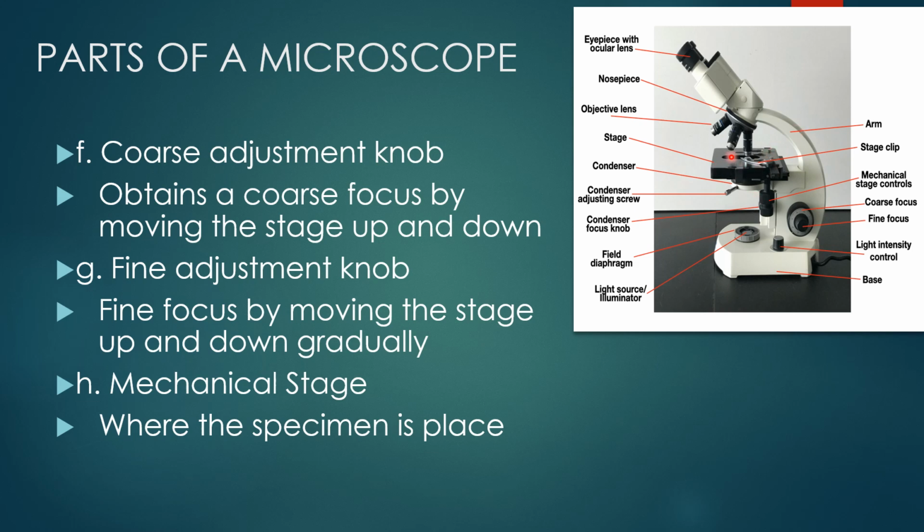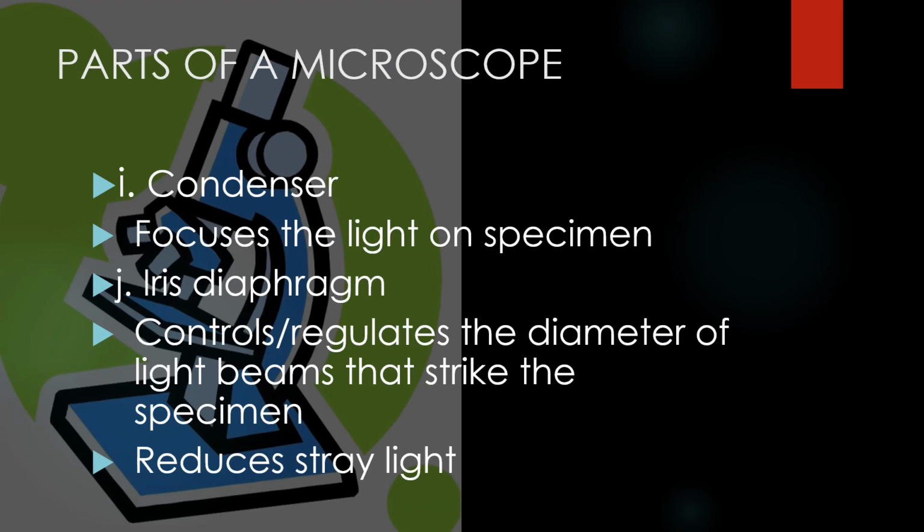This is for your mechanical stage. Yes, it can be moved. Mechanical stage. Okay, and then you have here your condenser that will focus the light on the specimen.